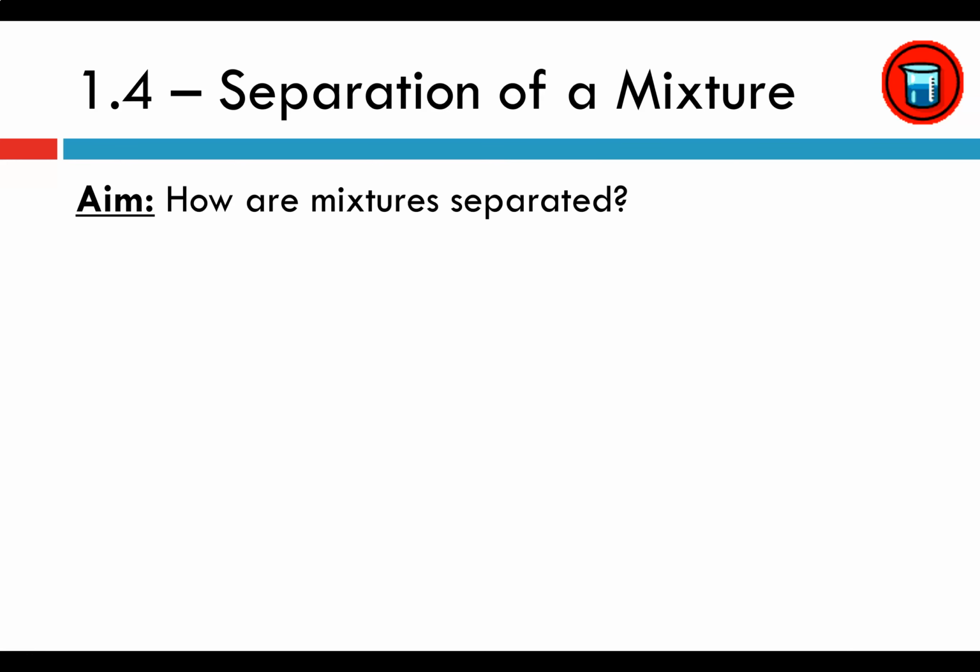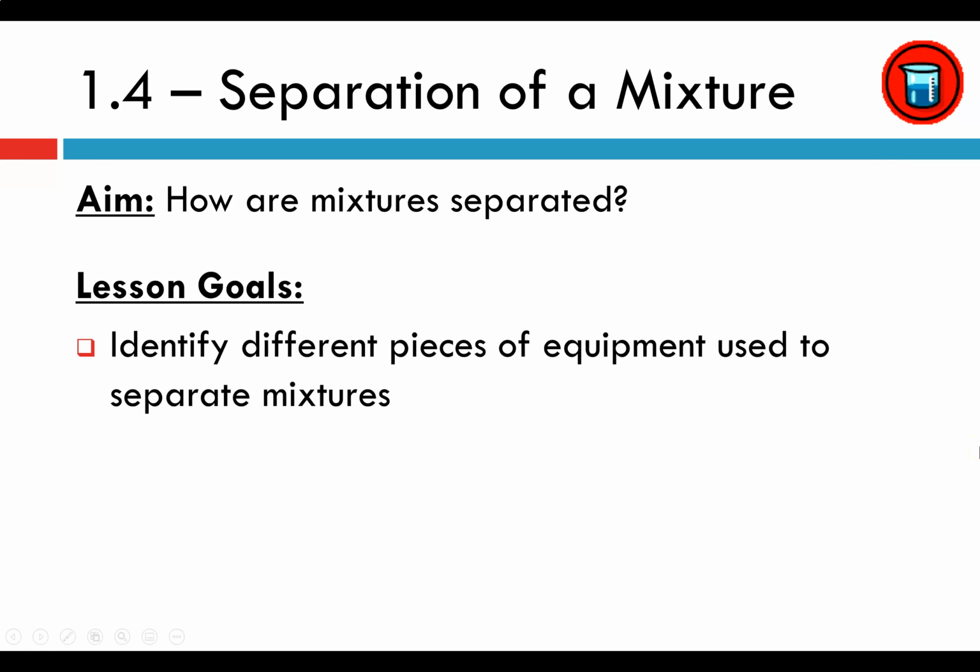In today's lesson, we're going to be talking about how to separate mixtures using different pieces of equipment. Now, my guess is that you're already pretty familiar with how to separate mixtures, at least pretty simple ones. So we just need to give you some pieces of equipment and some terminology to kind of tighten up your explanations a little.